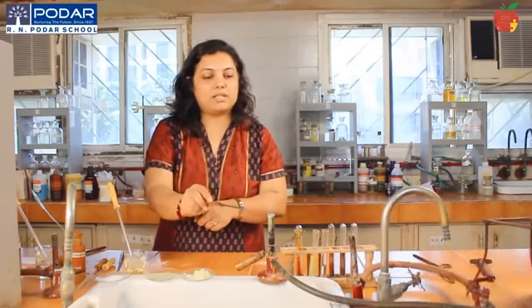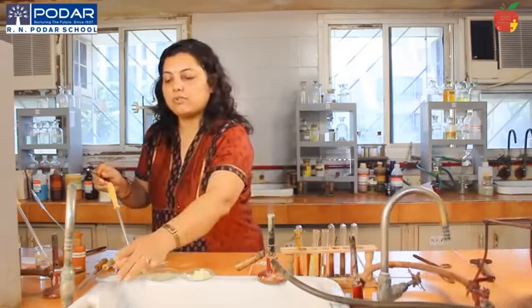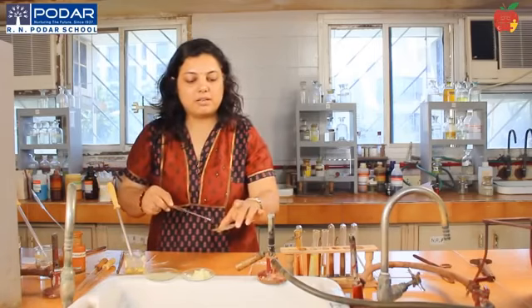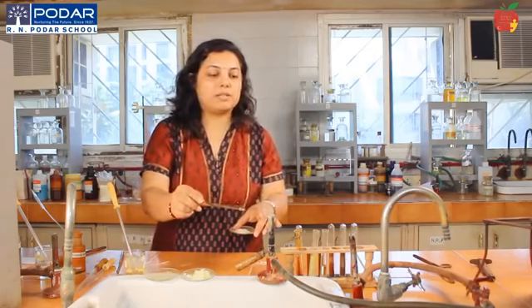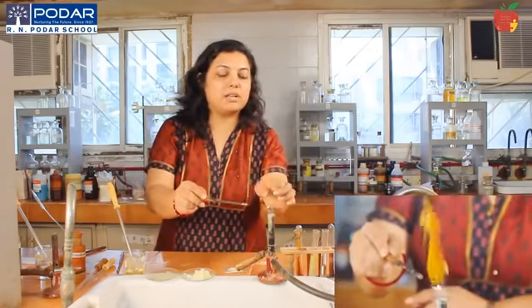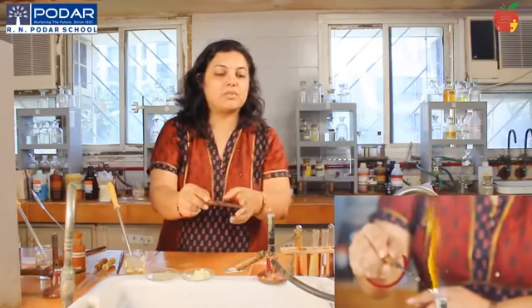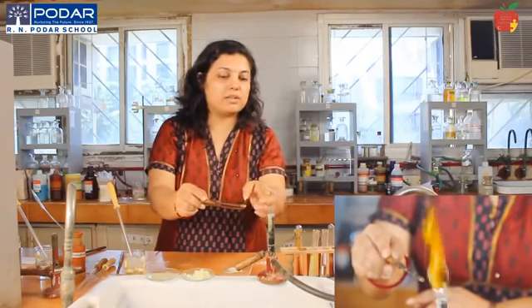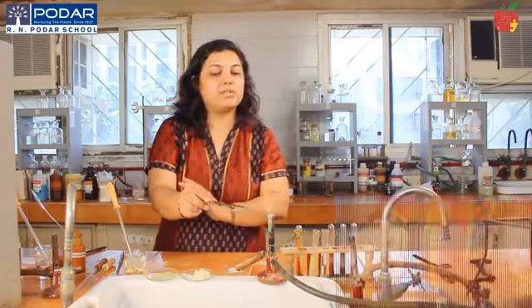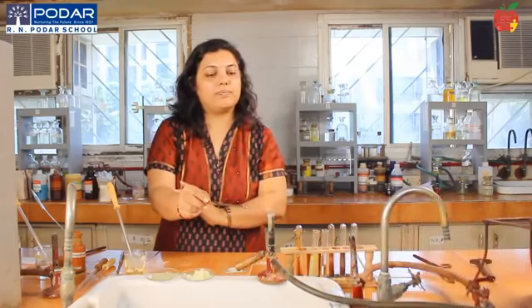Okay. Now let's see what happens with barium. You will take your barium, add concentrated HCl, make a paste, and then you should get an apple green color. You can see some streaks of green color coming. The reddish change is because we had used earlier salts, but you will get some streaks of green color in between, the green apple. So that indicates your barium.